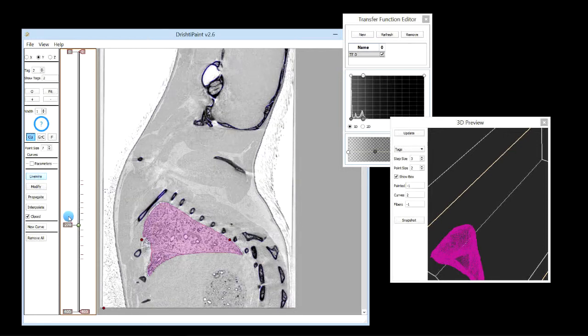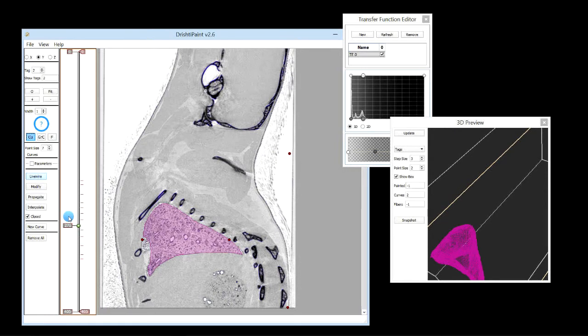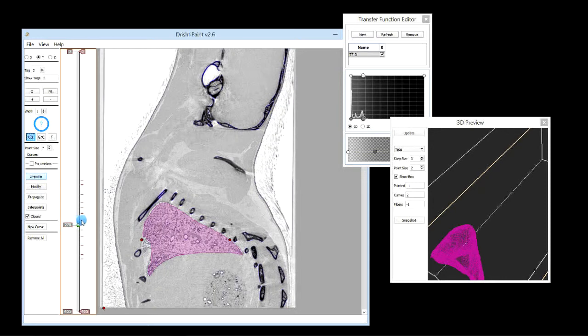Also, when you delete an interpolated curve, all the curves in that batch are also deleted. So for example, when we interpolated the curves, quite a few batches were created. There was a batch for interpolated curves between these two curves, then this set of curves will be interpolated as a single batch, and so on.